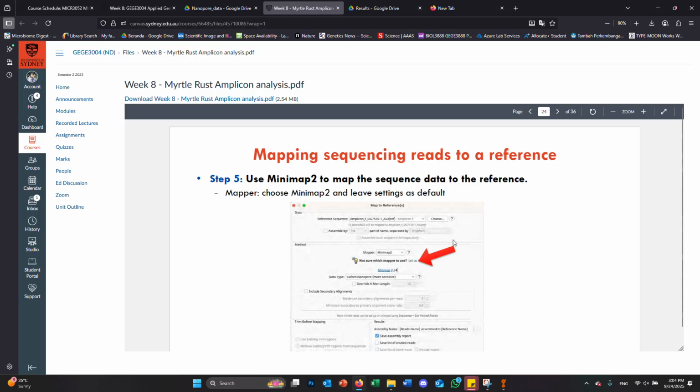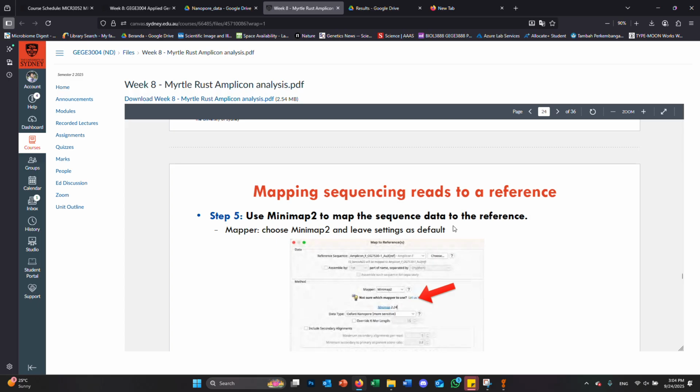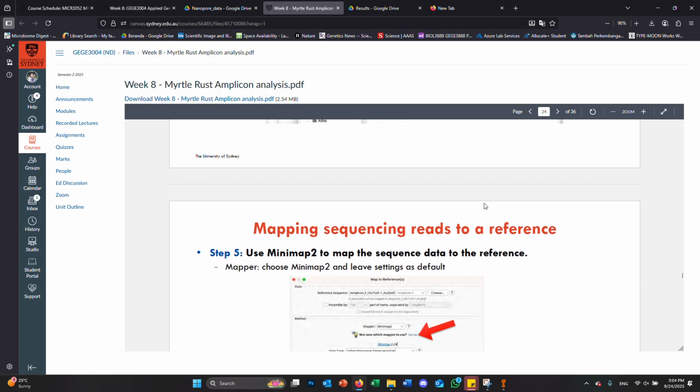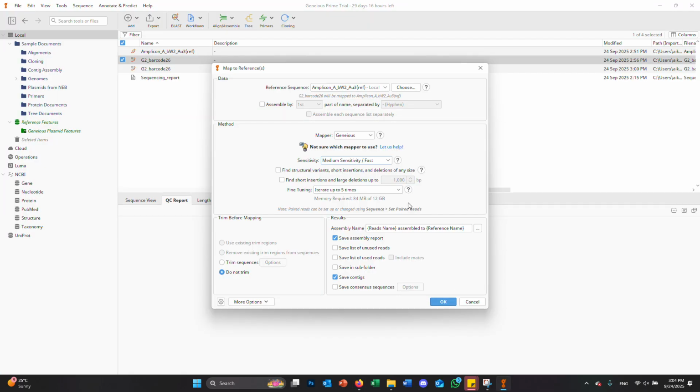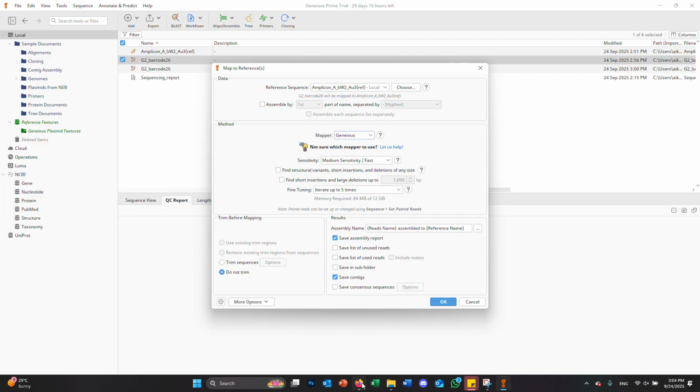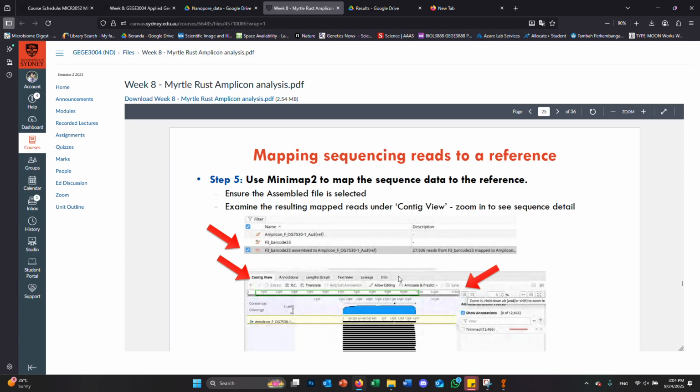Right, so I can see some people have got their file. Still working on a few glitches, but we should have zoom into your lab reads. The next step is going to be generating your consensus sequence, right? So I think you've learned about this before. Have you learned about consensus sequences earlier in the semester?